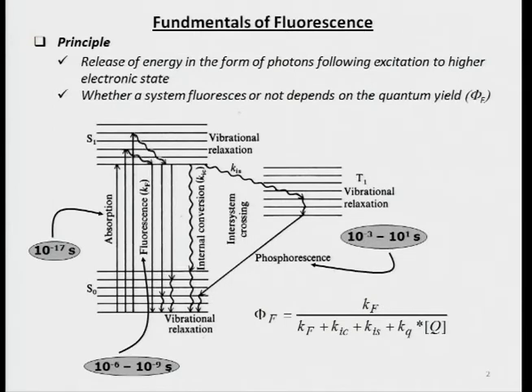Allostery, for example, can be fairly easily detected using either of these processes. The reason is that fluorescence and phosphorescence are significantly delayed in comparison to absorption. They're 1,000,000 or 1,000,000,000-fold slower. So what's actually happening here is that in absorption, you are actually zapping the system, but in terms of fluorescence, the system takes some time. So by that time, the electronic states can actually change. The electrostatics can change. Structural changes can occur.